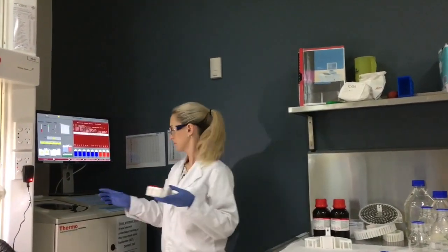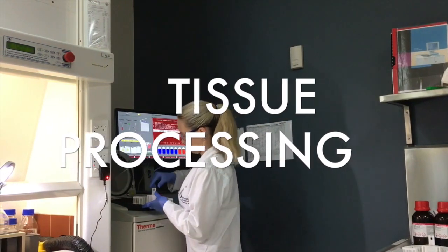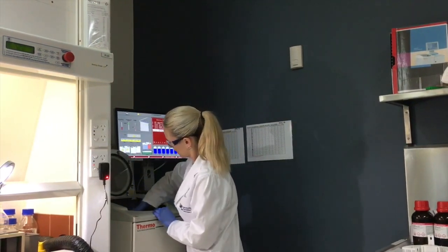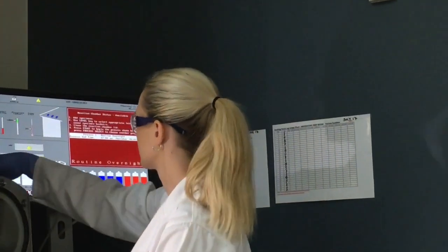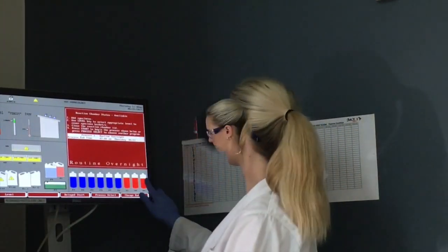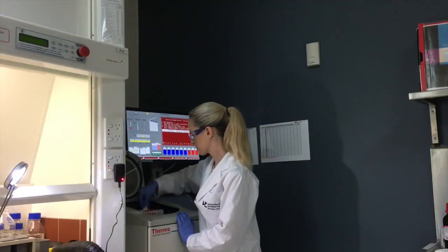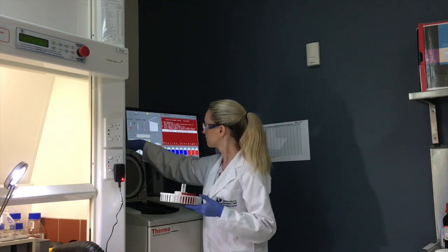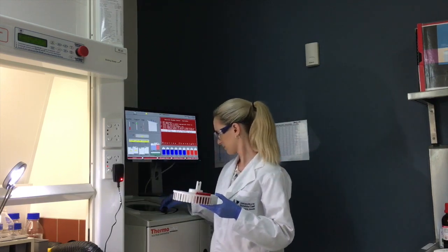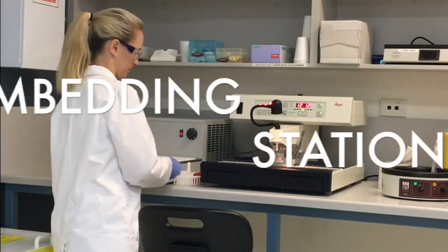Once fixation has occurred, the samples are placed into a tissue processor, which is an automated machine that pumps the chemicals in and out of the tissue specimens. This is necessary to remove the water from the tissue and replace it with the molten paraffin wax. The molten paraffin wax will eventually set hard so that a microscopic section can be prepared.